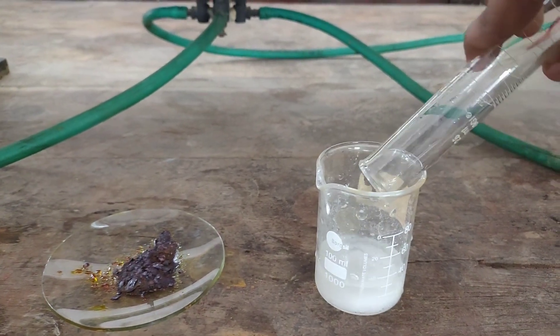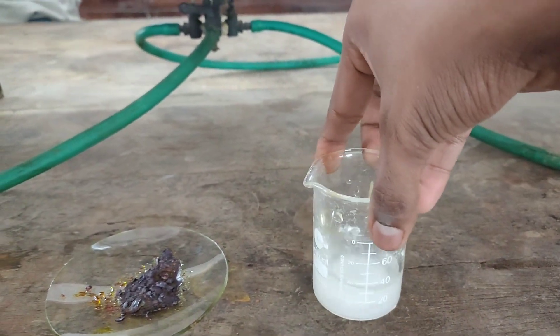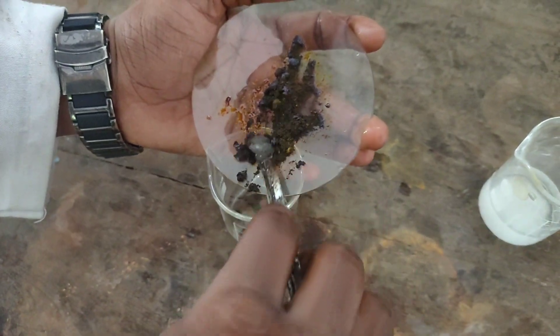15 ml of distilled water was added to potassium oxalate. The ferric chloride was added to a beaker and it was dissolved in a minimum amount of distilled water.